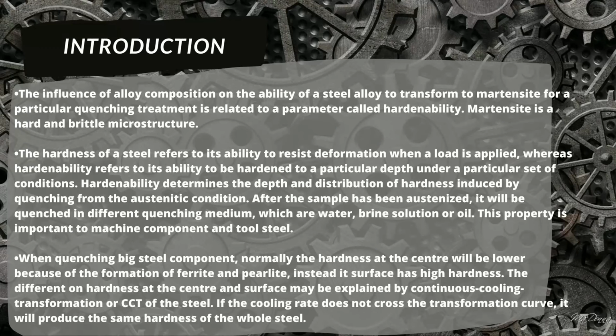This is the introduction for the Hardenability Test. The influence of alloy composition on the ability of a steel alloy to transform to martensite for a particular quenching treatment is related to a parameter called hardenability. Martensite is a hard and brittle microstructure.